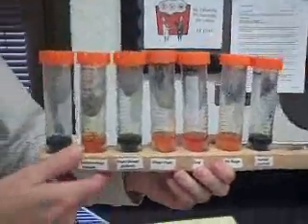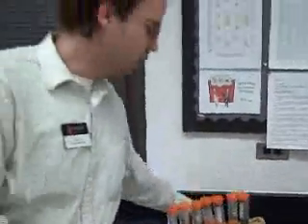So that's basically a summary of experiments in this lab. You need to read over basically this step: alcoholic fermentation, lactic acid fermentation, aerobic cellular respiration, and anaerobic respiration.